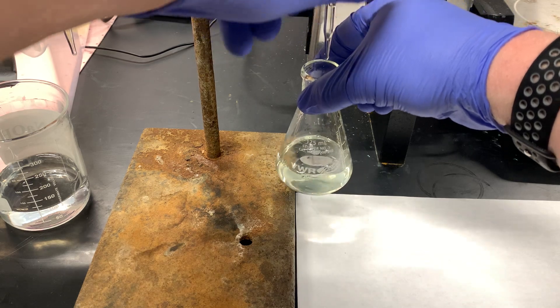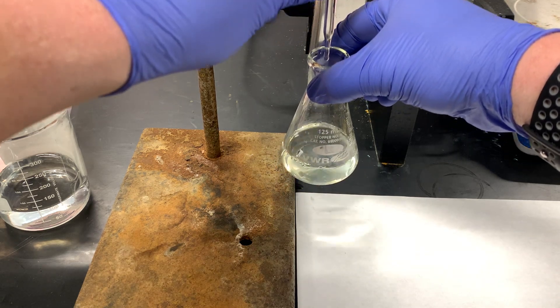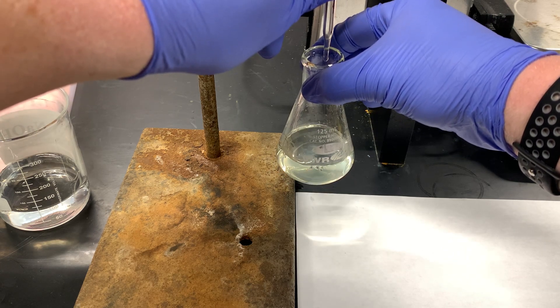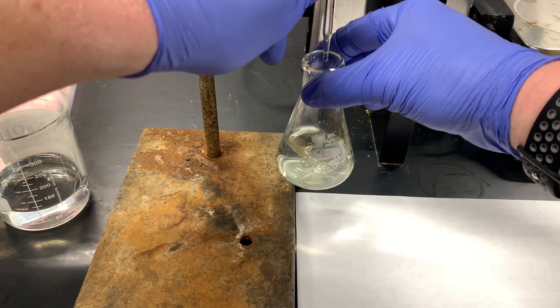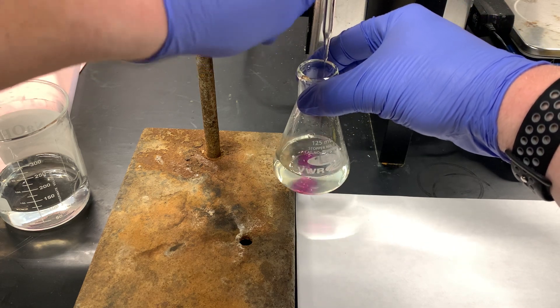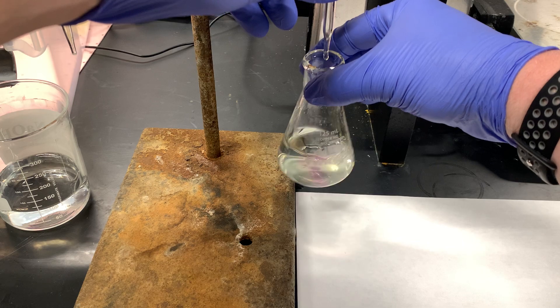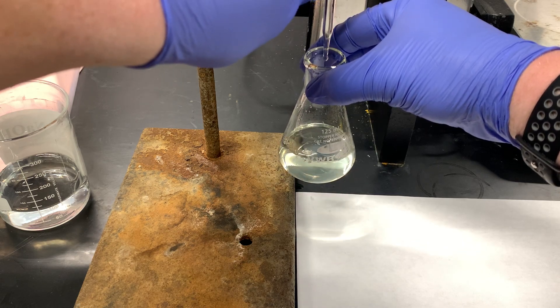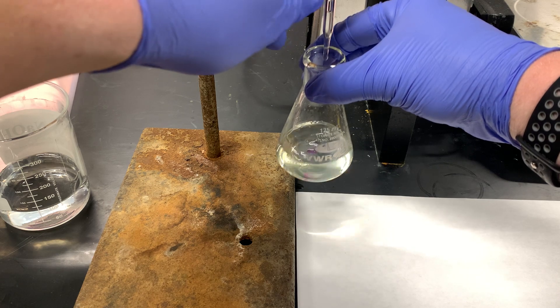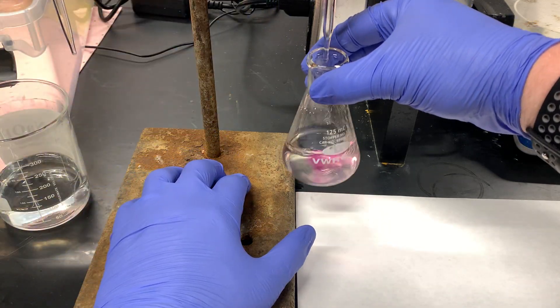I've added a little bit of my solution. I've positioned myself so that I can adjust the valve and stop the flow of my solution very easily as that color change is going. I'm going to try to get this down to a drop-wise transfer.